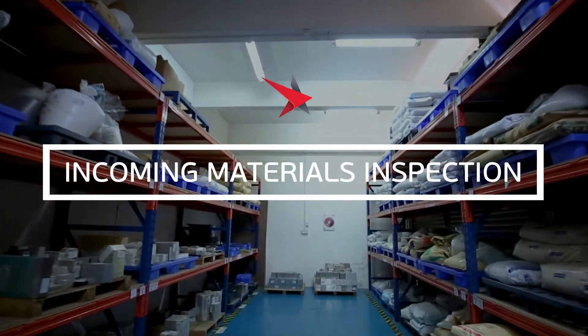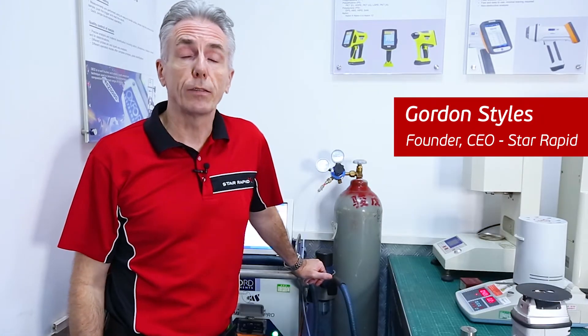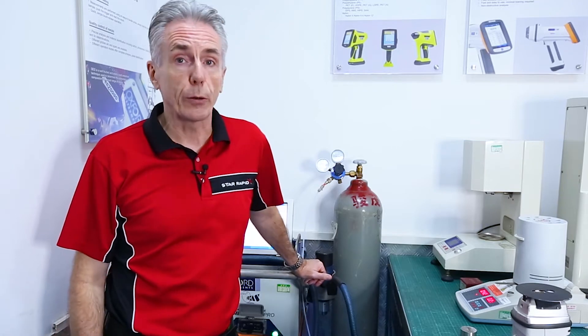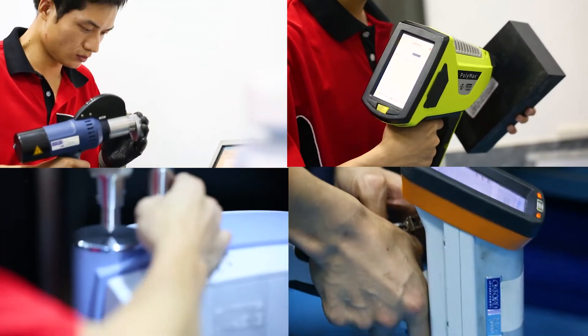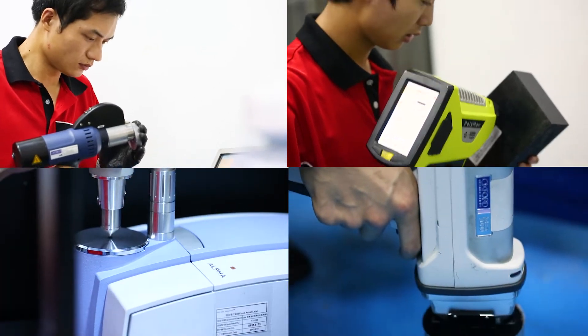Welcome to our materials goods inwards inspection department. In here we have a whole variety of different machines. We've spent hundreds of thousands of dollars on materials testing equipment. We've got four main pieces of testing equipment and they are effectively spectrometers.